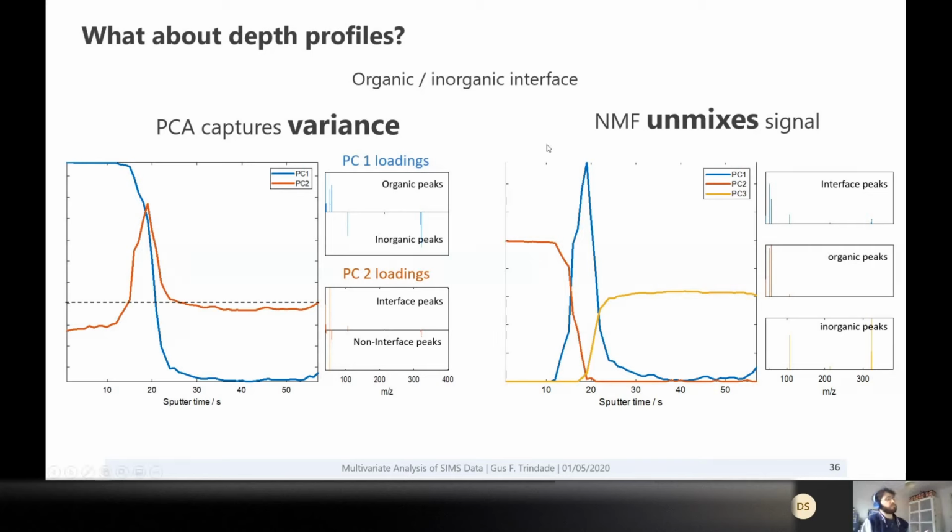So obviously we do them separately. They're not related. That's one thing about NMF, and I didn't give this detail: you have to say how many components there are, because it's an approximation. In PCA, we find as many principal components as original variables because it's a rotation. In NMF, you have to say specifically.